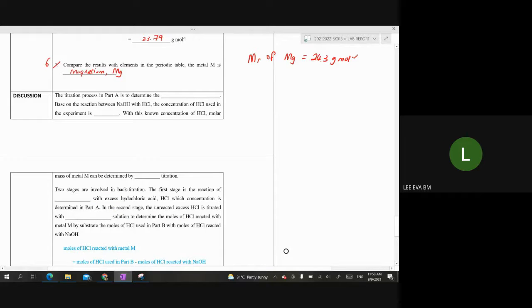After NaOH, the target, or you can refer to your learning objective for the first one. Concentration of HCl solution. Yes, we want to know the concentrations. If we are not using determine, we can use to standardize, okay, the concentrations of HCl. So nanti pakai dalam ayat lah concentration HCl. Mereka banyak simbol square bracket refer to concentration.